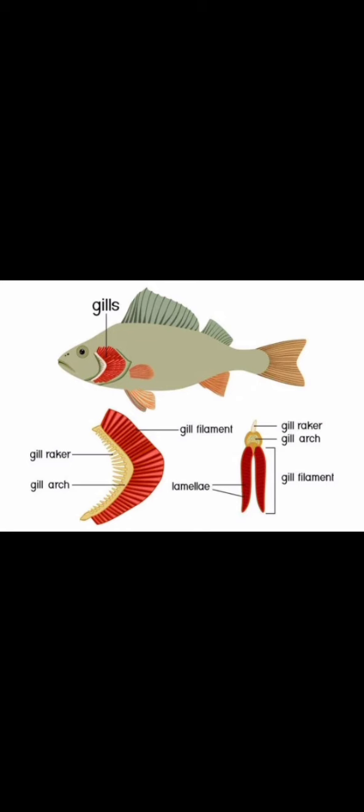This is a specimen analysis for Biology 2024 West African Senior School Certificate Practical Examination. We're going to compare some of the specimens, all of the specimens, with the ones that can be compared.